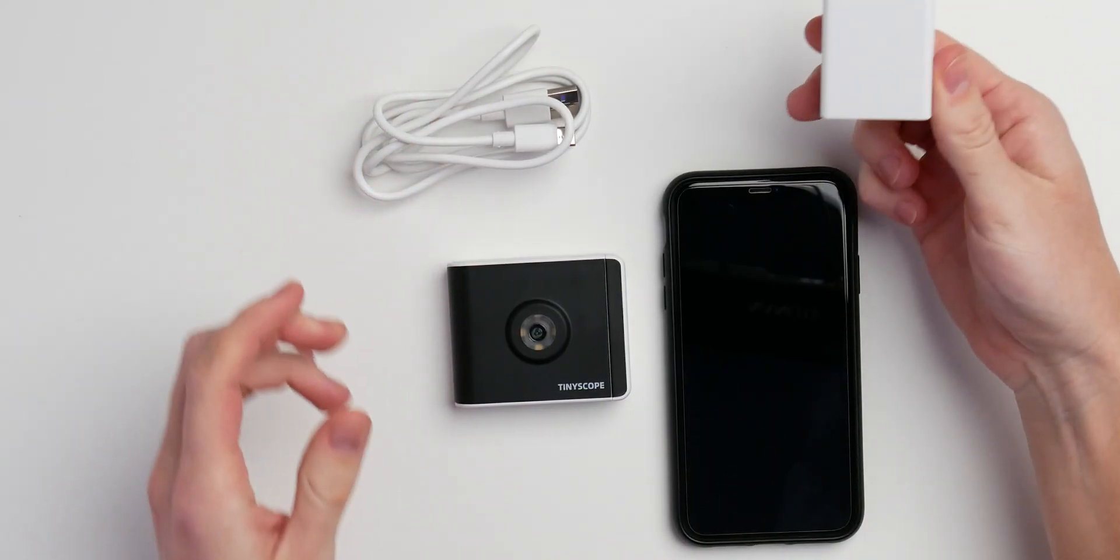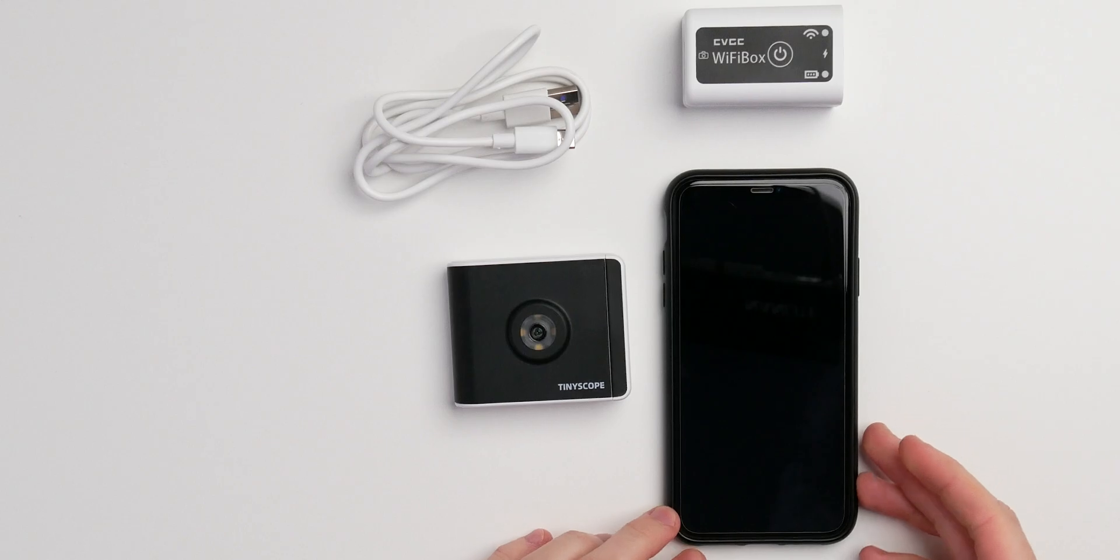Okay, so all you just need is your TinyScope, the cable, your WiFi box and an iPhone and you're just good to go. Way smaller and way simpler than the microscopes I know from my school time. Way smaller.